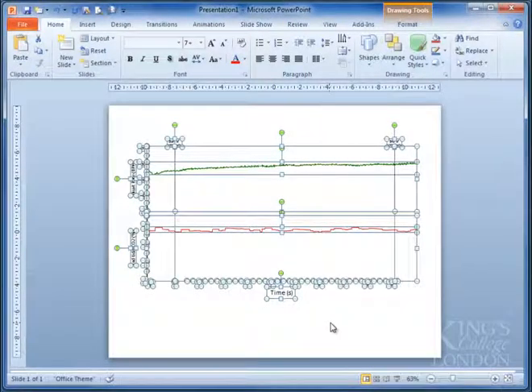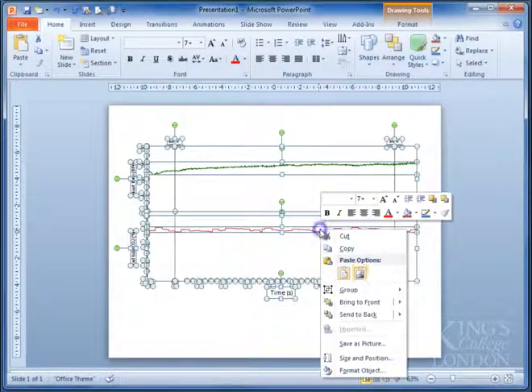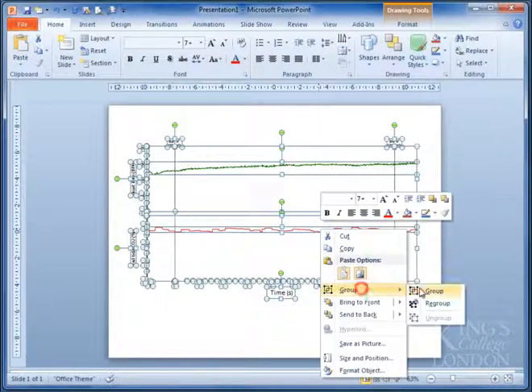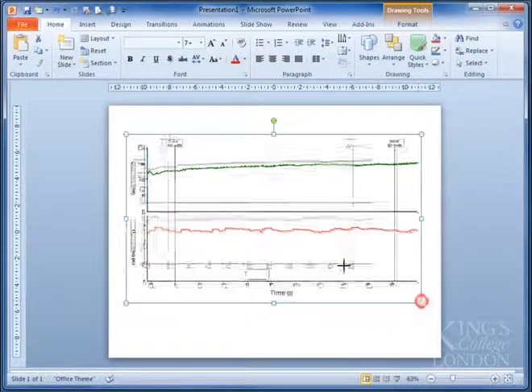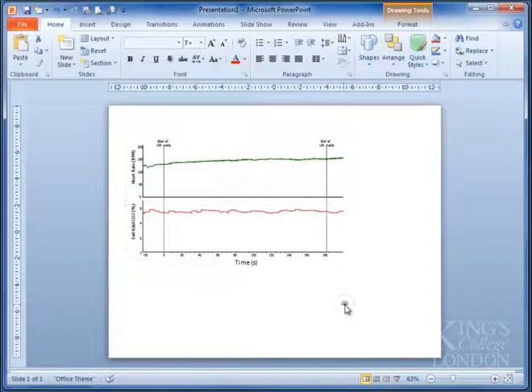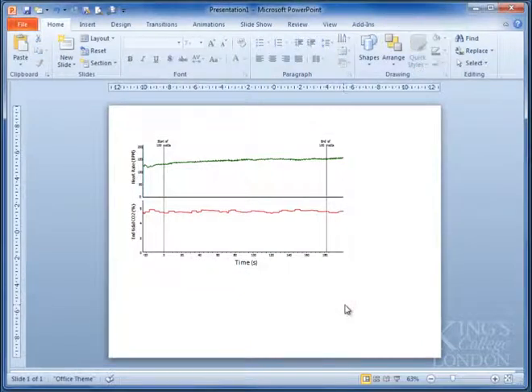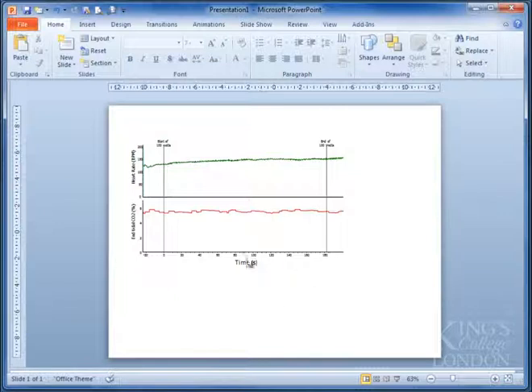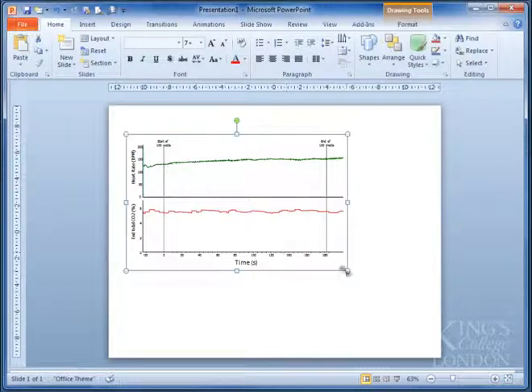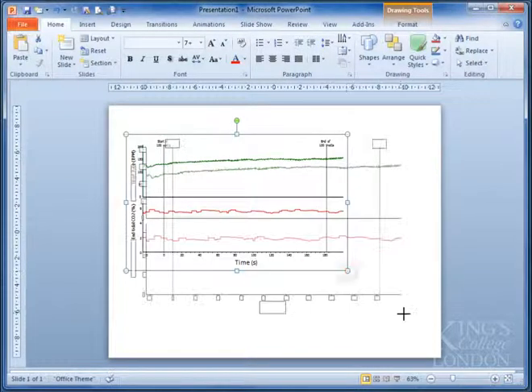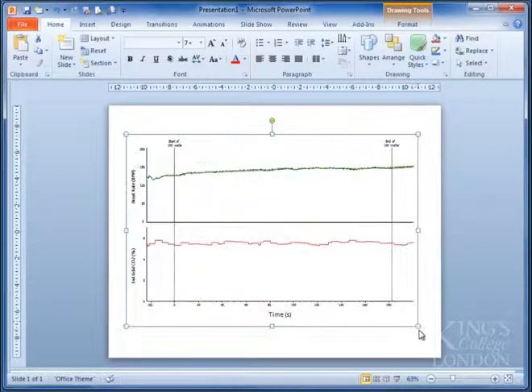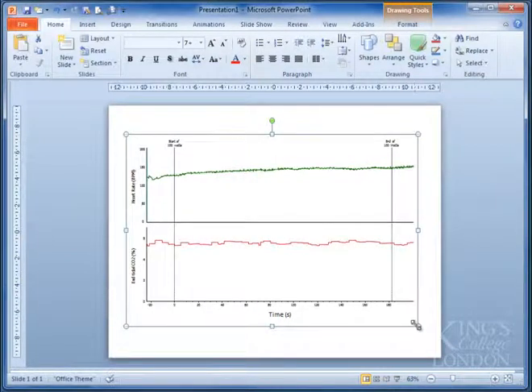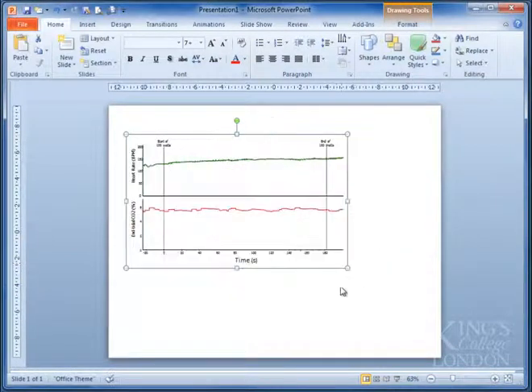Okay, so now we've edited, we've highlighted everything, and I can right click now and group it all again. And now this is a scalable, very nice, clean drawing that can be copied and pasted into Word or any other program and used as an image. And I think you'll find that that is a lot more useful for presentation than when we had when we started.